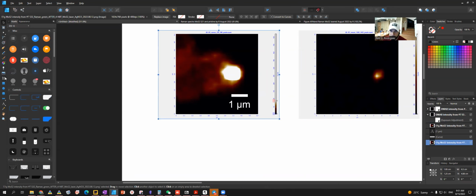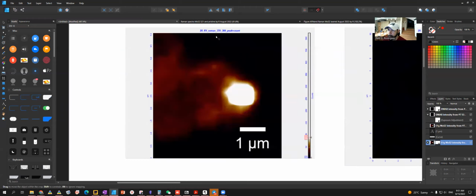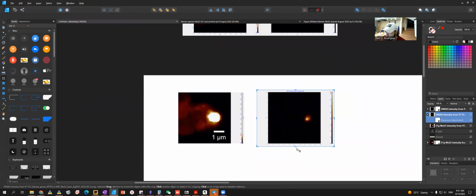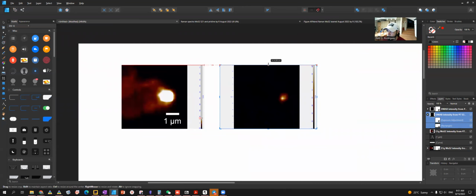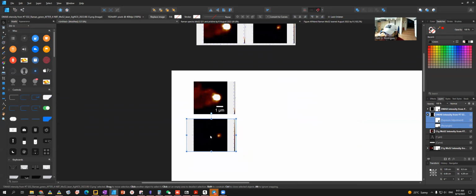So what I'm going to do is crop this side, and duplicate with this one. Well, you could do it now, or you could do it later. But the good thing is if you do it now, you will see it will automatically align to the previous one you did. So we put it this side.